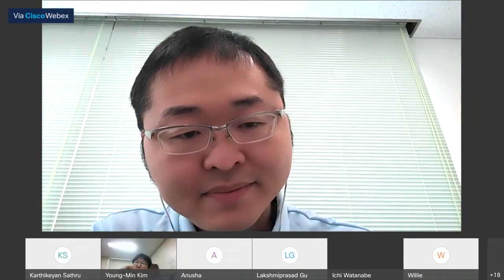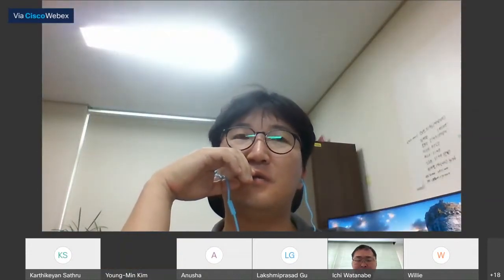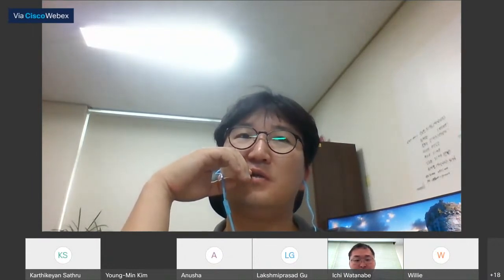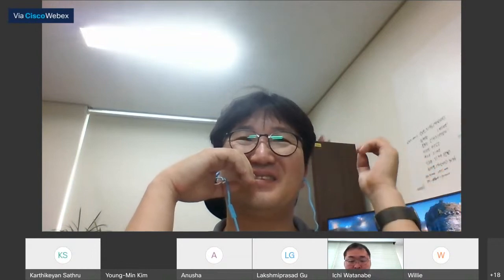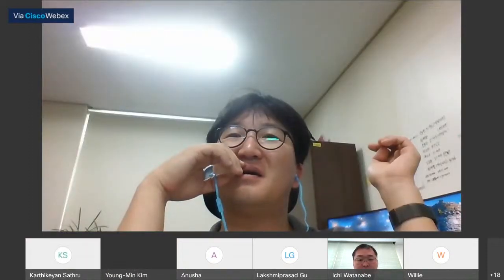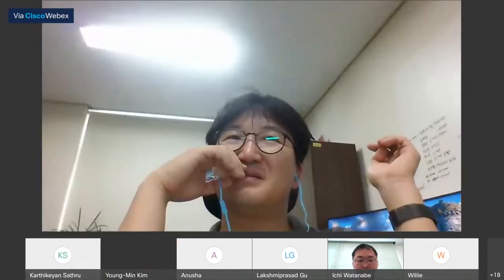So I'm a little confused. What is the meaning of online and offline systems? It indicated the EGA and the separation, in situ or ex situ. Sorry, I couldn't understand the question. Because maybe they would have seen only the online analysis with the EGA. So they may want to know how people are doing offline. That means it may be a separate, standalone reactor where they burn things and collect the sample and inject. So that could be offline. That may be the question, I think.